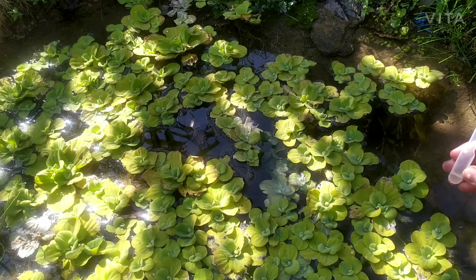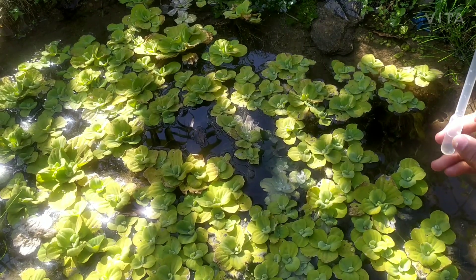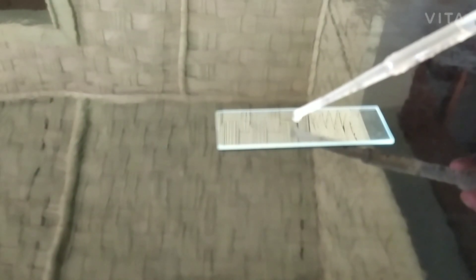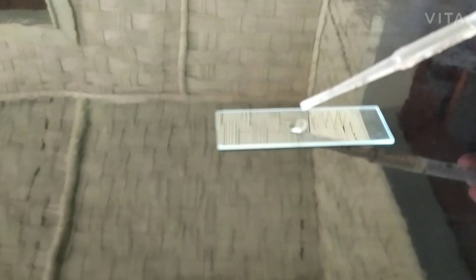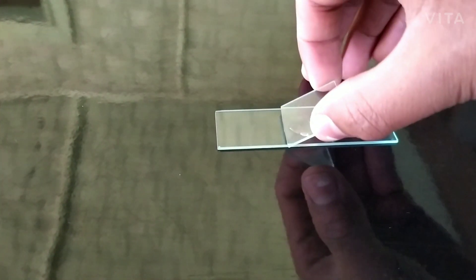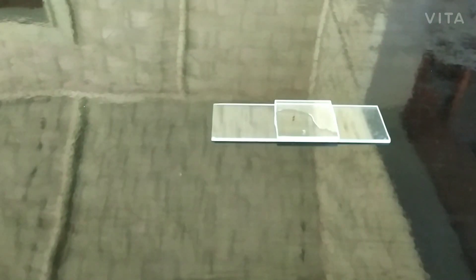I'm taking a small amount of it to observe under a microscope. Put one drop of collected water onto the microscope slide and place the cover slip without making any bubbles. Now your microscope slide is ready to be observed under a microscope.